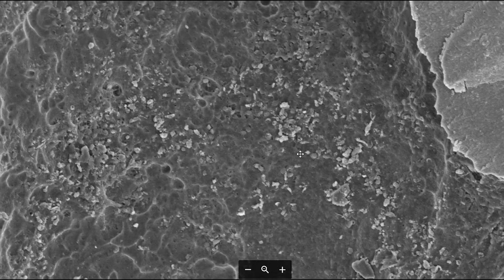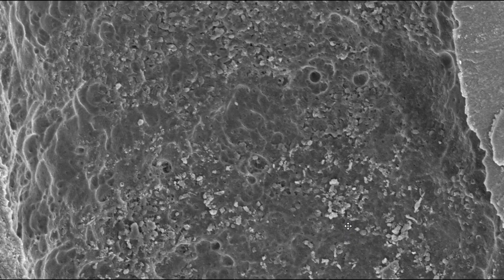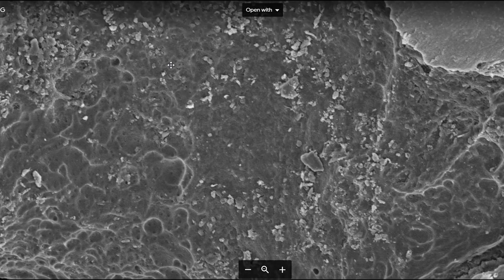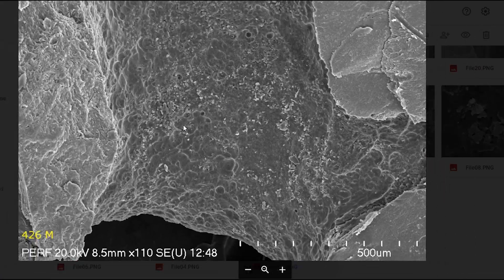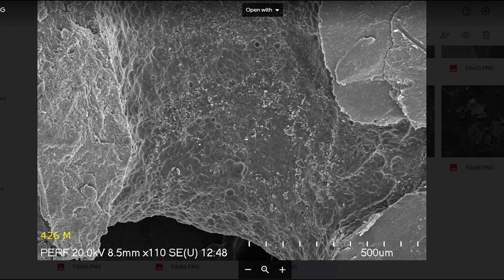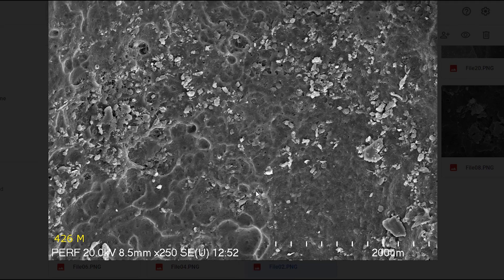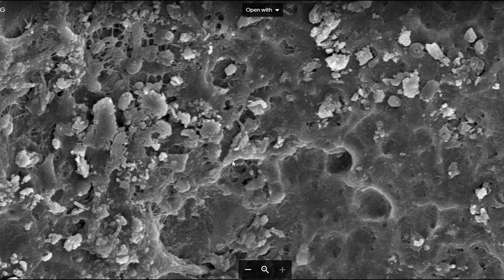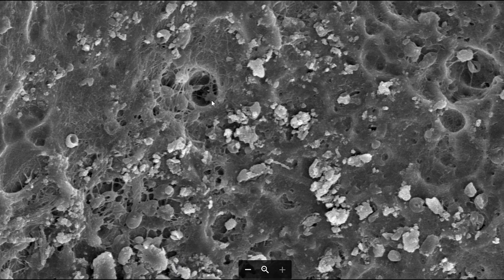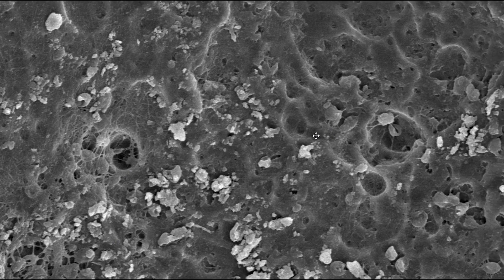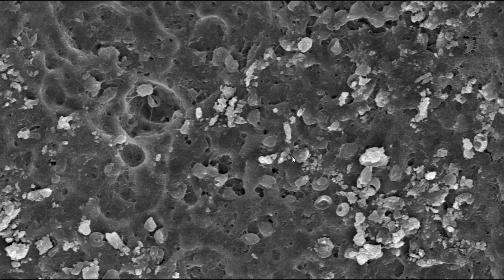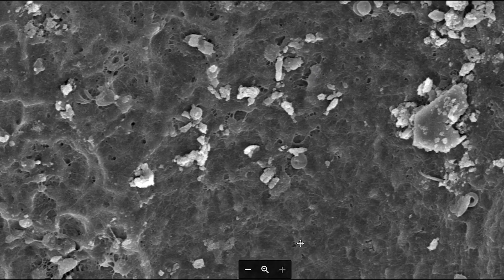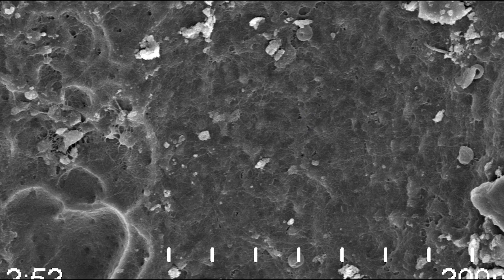This is the mesial buccal canal, and you can see it is exceptionally clean. It looks like there are a few red blood cells. You can see the resorptive area that is very common with teeth with apical pathology. Some of the collagen from the pre-dentin and odontoblastic layer is still present, but there is no evidence of any bacterial growth or bacterial biofilms anywhere in the mesial buccal canal at all. It looks very, very well cleaned out.